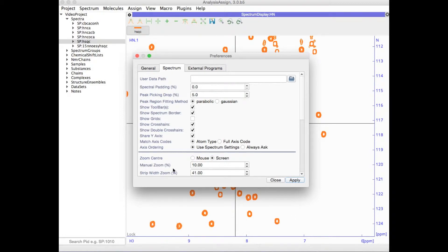Under manual zoom, you can also select the percentage by which the zoom goes up or down when you zoom using the keyboard.